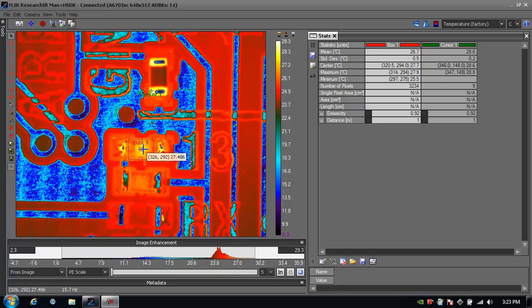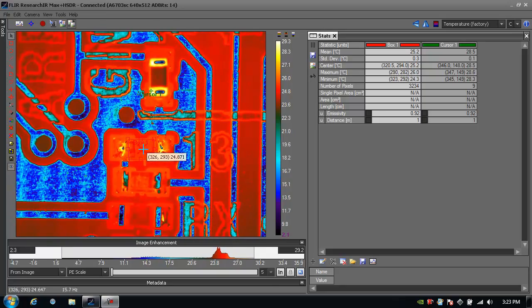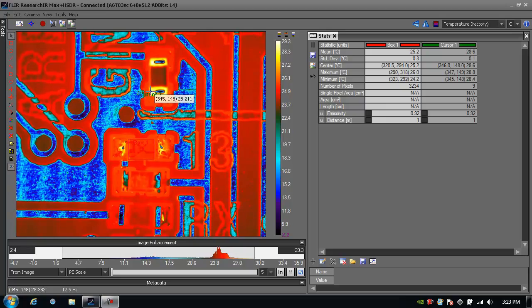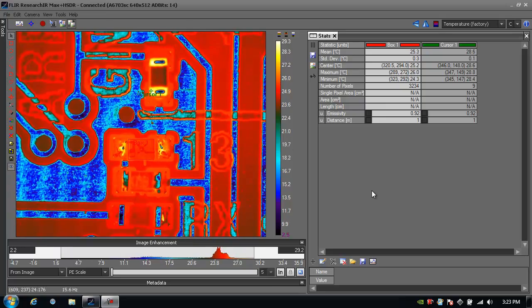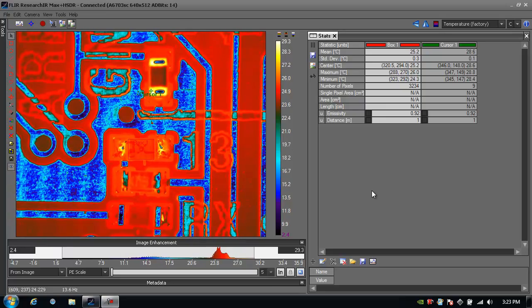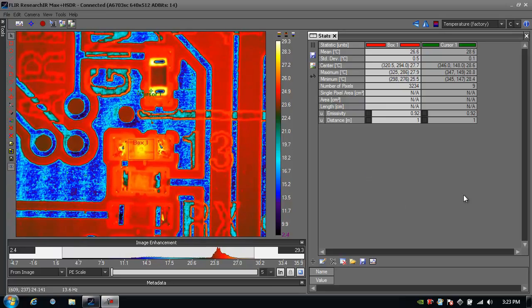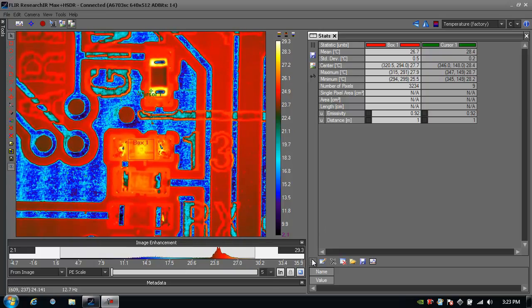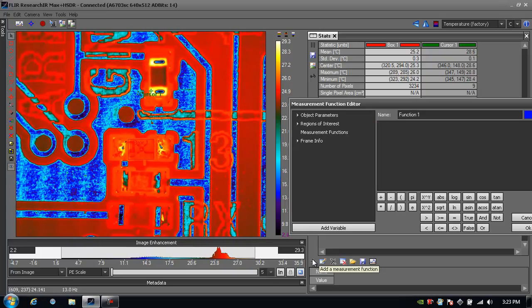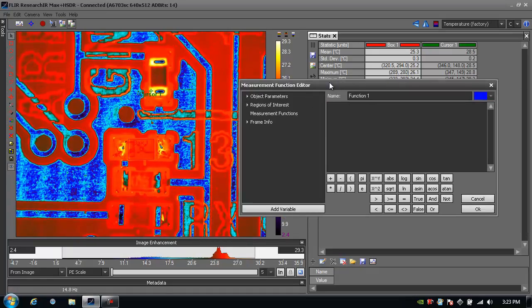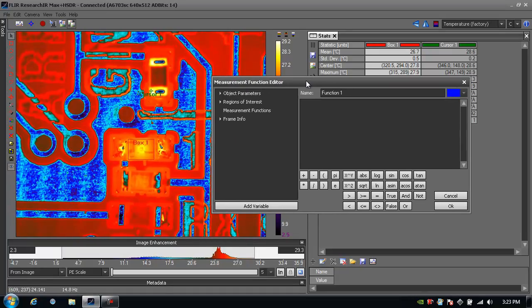I've created a box measurement tool as well as a cursor measurement tool, and I'm going to reference these when I create a measurement function. Now I've docked the stats window just to the right of the image and down here at the bottom I'll see my measurement functions. I click on the plus sign and it brings up a measurement function editor.